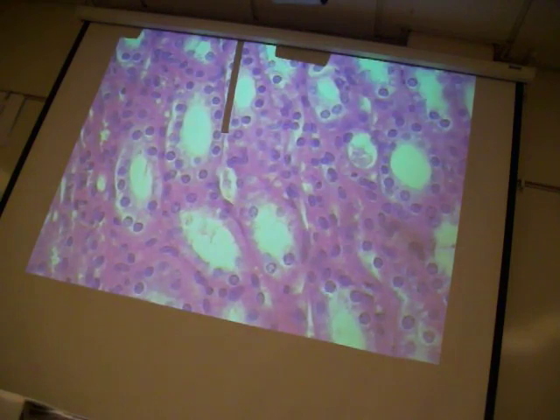All right, everybody feel pretty comfortable with that? So make sure you recognize this. You can name the tissue type, name a location, and give a function. Those are the 3 big things that you want to know about for each one of these tissues. Kidney's fine. You could say glandular cells, glandular tissue, glands. Everybody feel pretty comfortable with these?